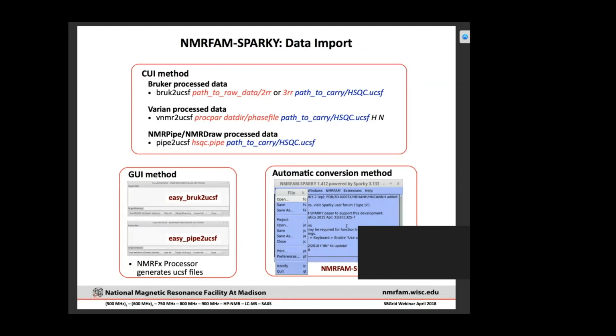So, like I mentioned a few times, about the raw data format processed from the time domain data: you have frequency domain data processed in TopSpin, in case you collected the data from a Bruker machine and processed it in TopSpin, then you will have Bruker processed data. Or Varian can make its own processed data.